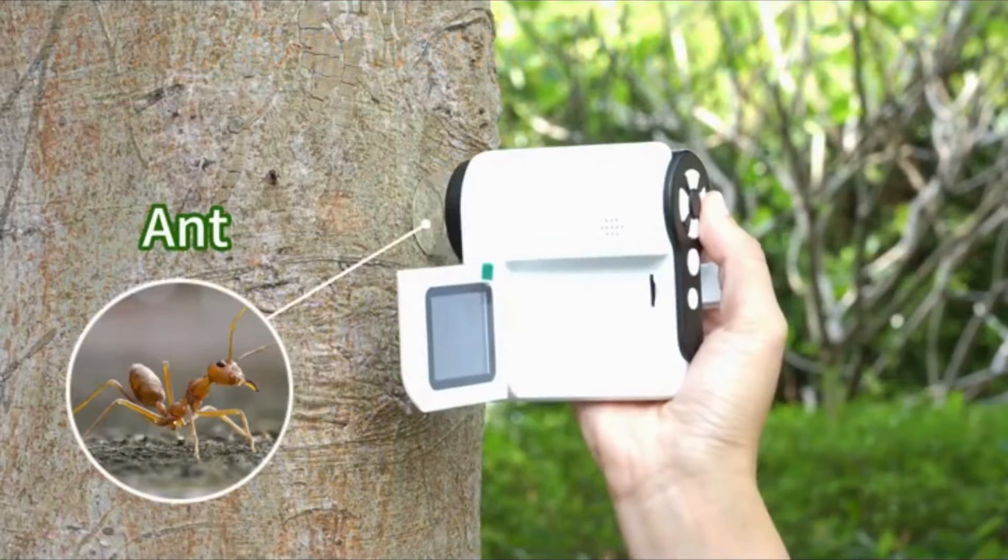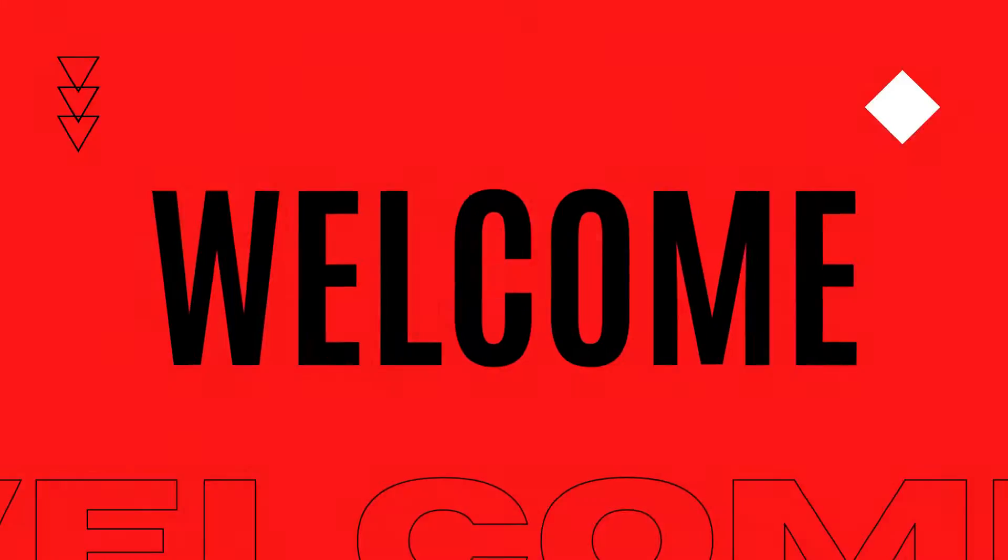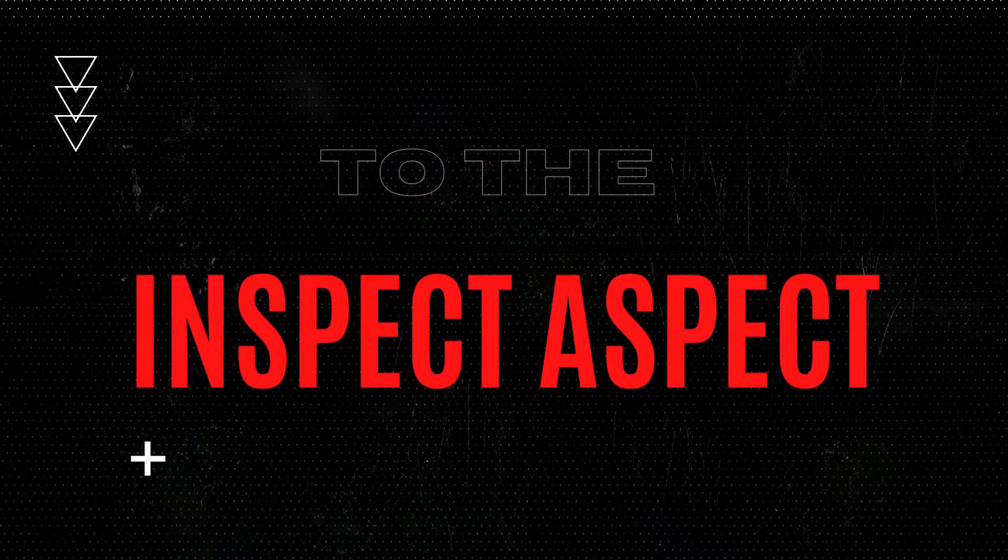What if the tiny world hidden in plain sight could be revealed to curious eyes? Imagine the wonders waiting to be discovered at a thousand times magnification.